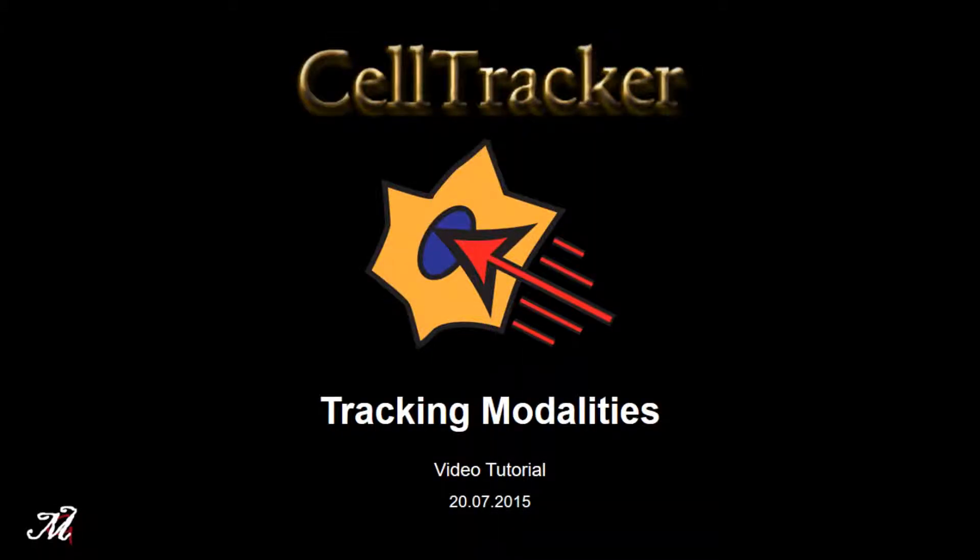Welcome! In this video tutorial, I will briefly show you the different tracking modalities implemented in CellTracker. Please, before running CellTracker, read the help documentation file provided with the software.